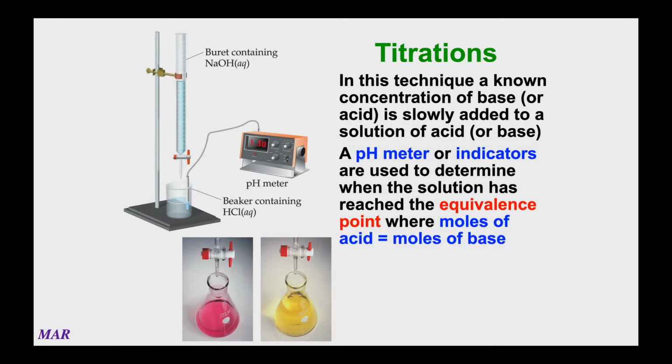In this section, we're going to talk a lot about titrations. And in the lab, titration is a really helpful analytical technique. If you've taken previous chemistry classes with me before, in Chem 221, we looked at the determination of an unknown chloride lab, where we were able to use a titration to find the percent chloride in an unknown. In an acid-base titration, usually the goal is to find, say, for example, the molarity of a solution, or you can also find the molar mass of a solution. Lots of different things that we'll be exploring.